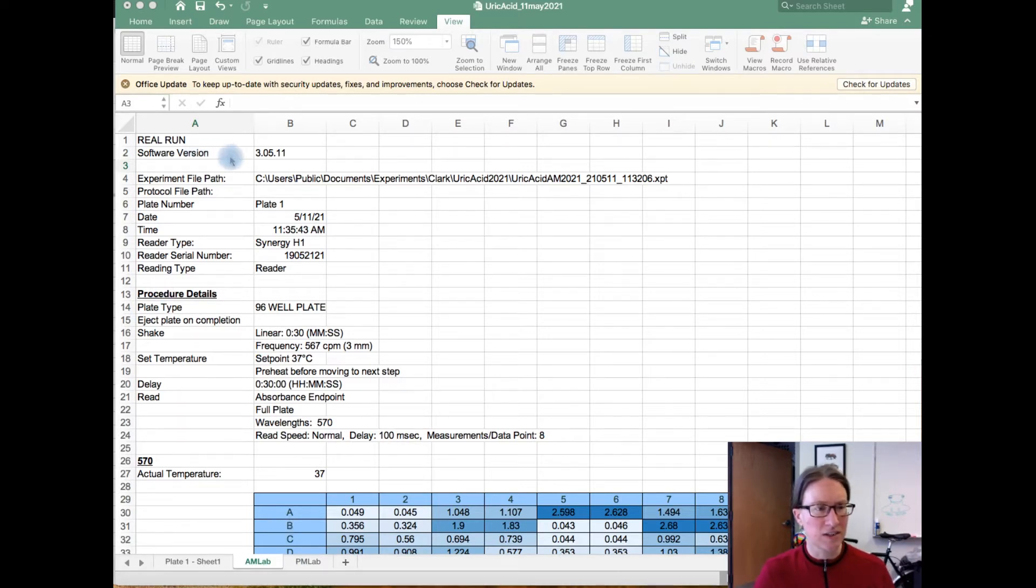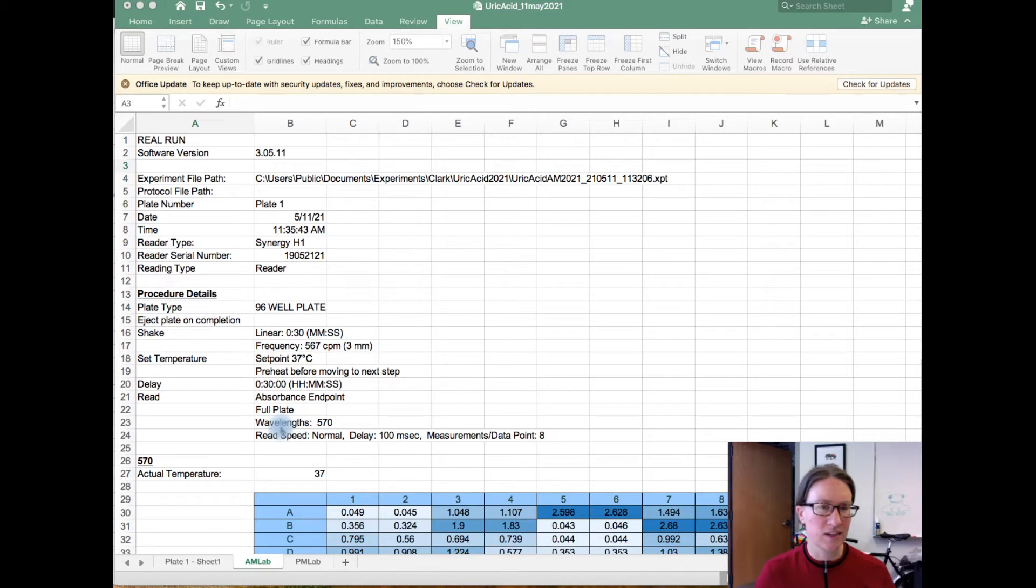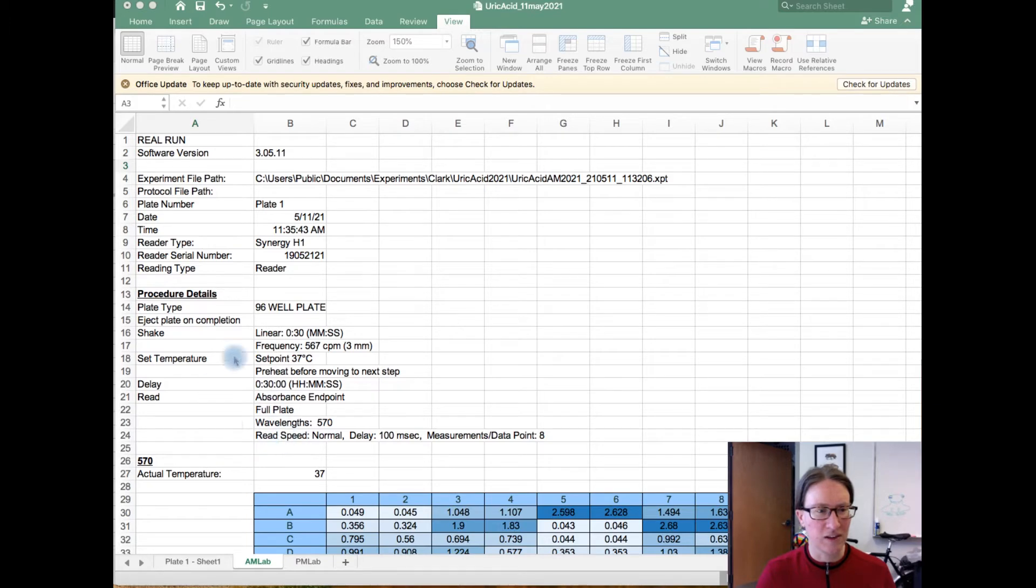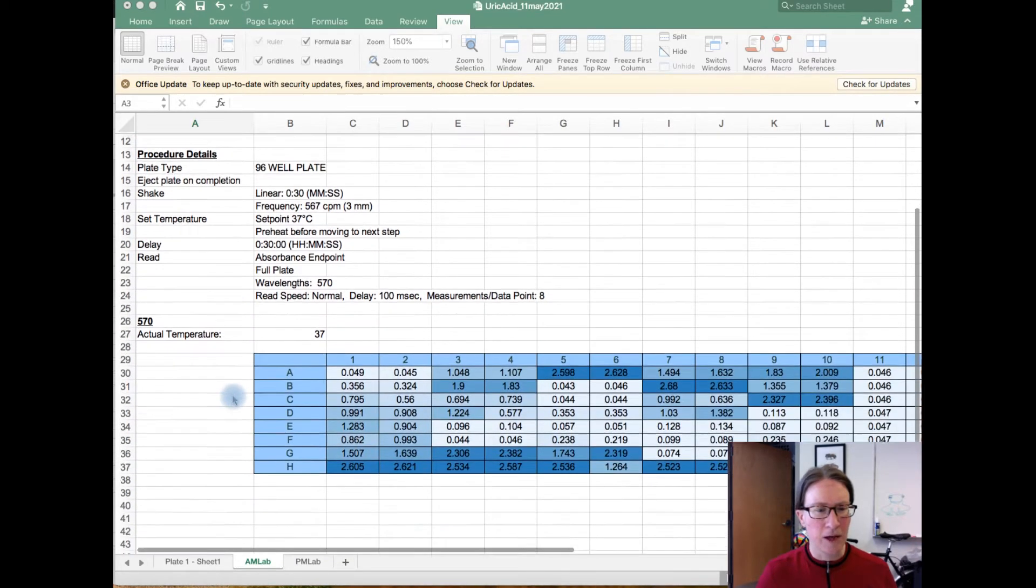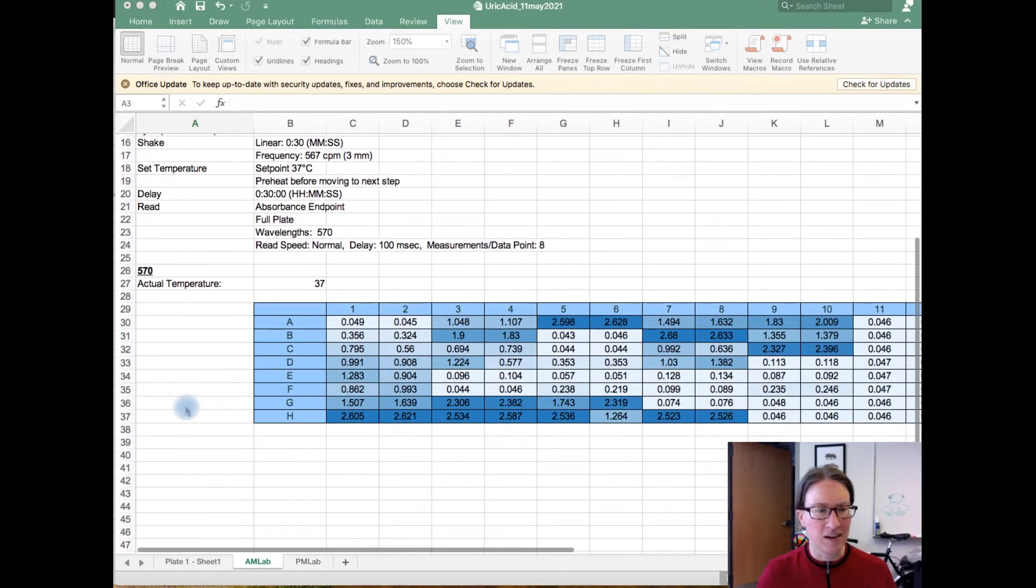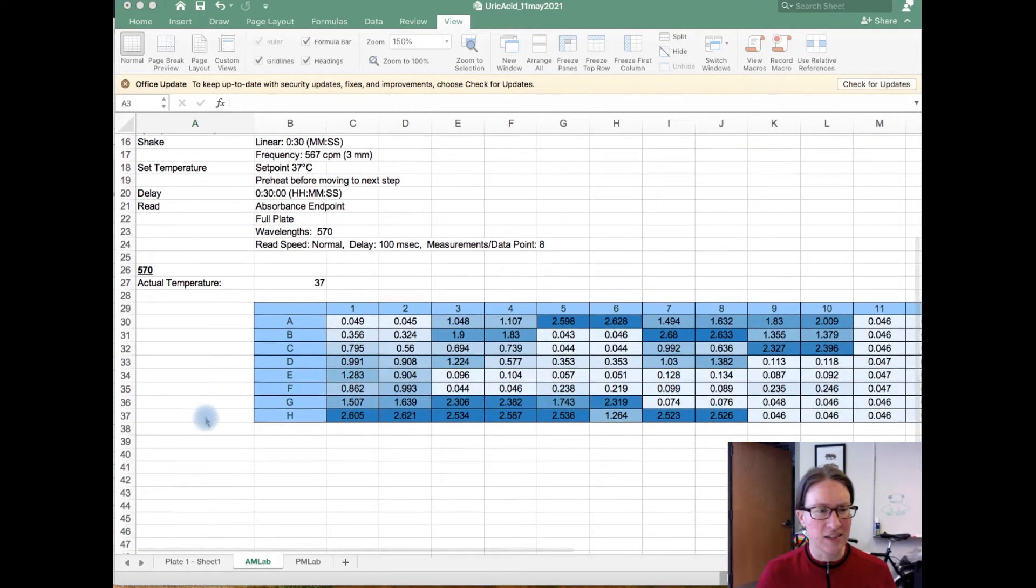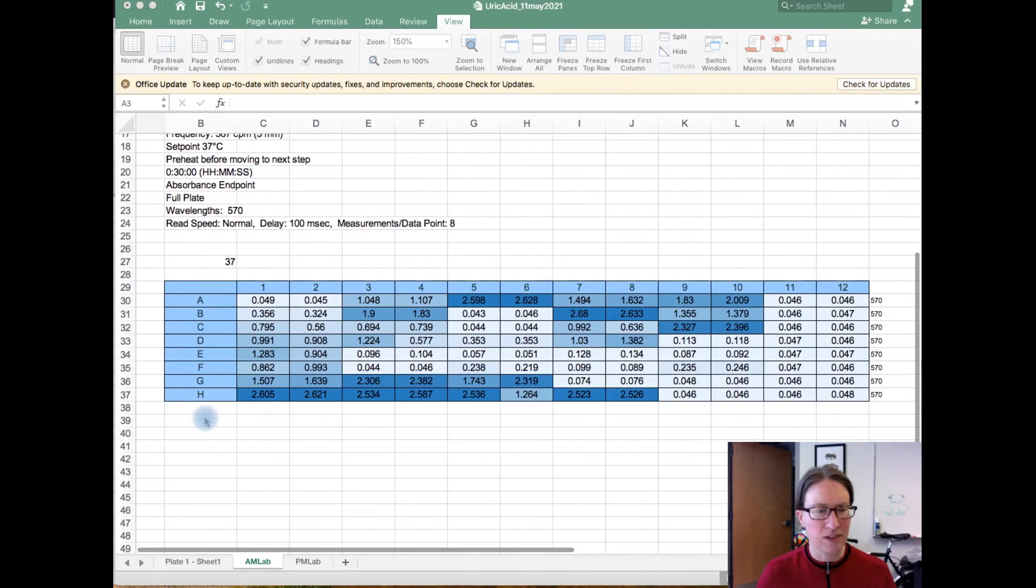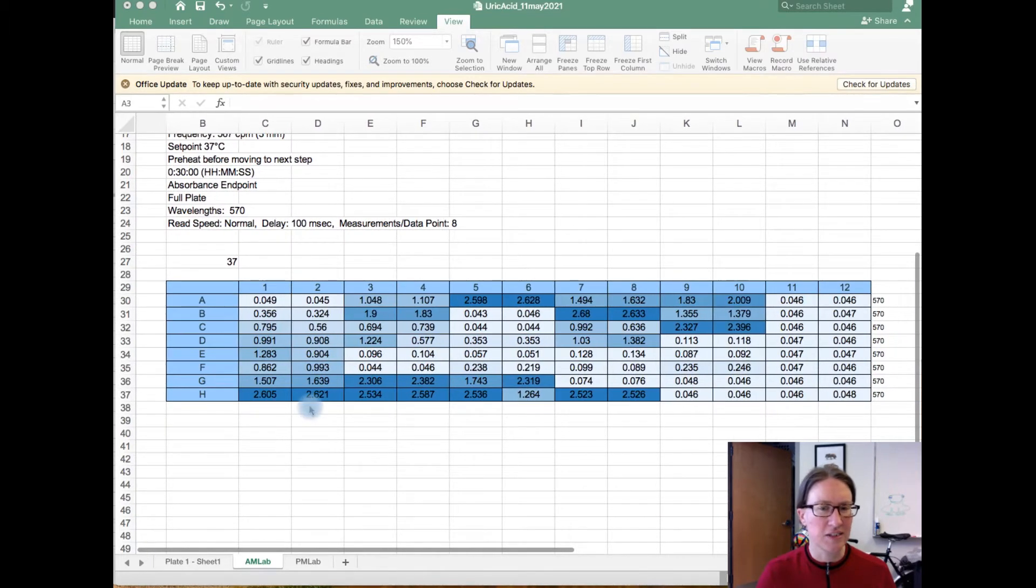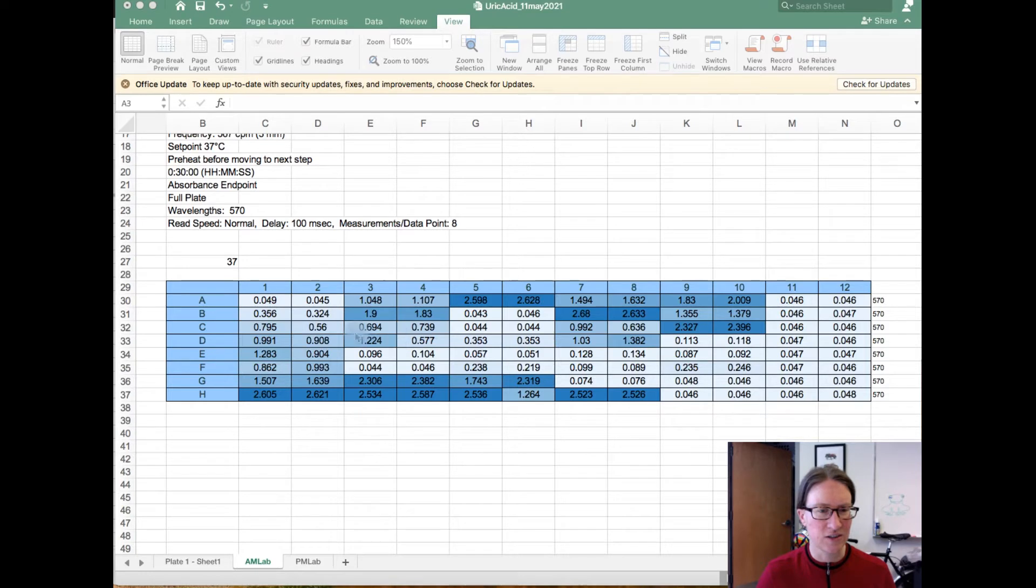In general we can kind of ignore a lot of the information that's up here, but this gives us a track record for what happened to the plate, including what wavelength the plate was read at. But then below that is a map that shows us the absorbances across all of the wells that contain the standards and the samples.